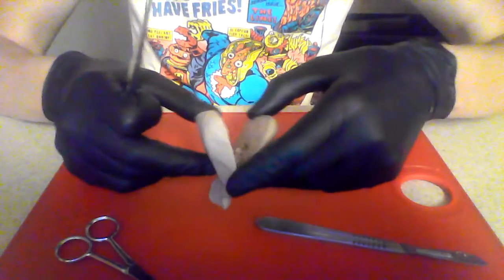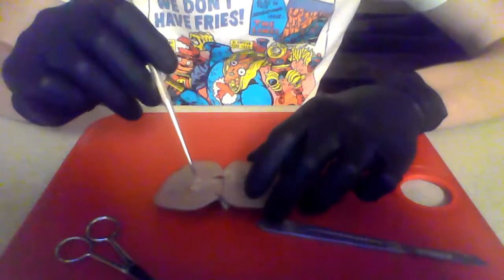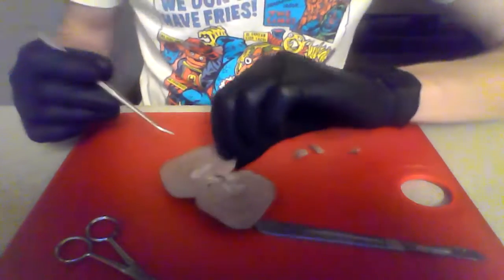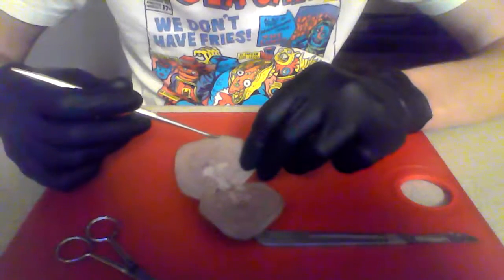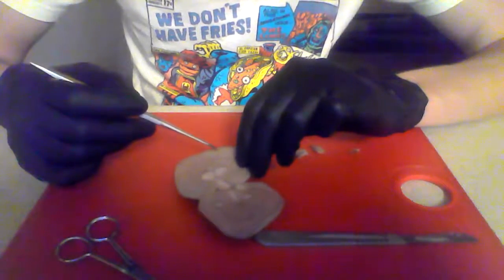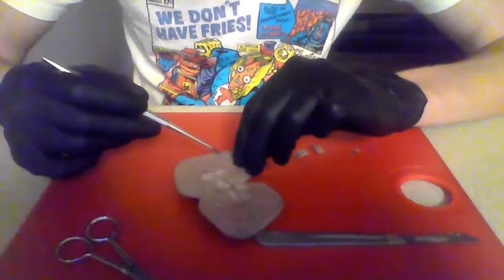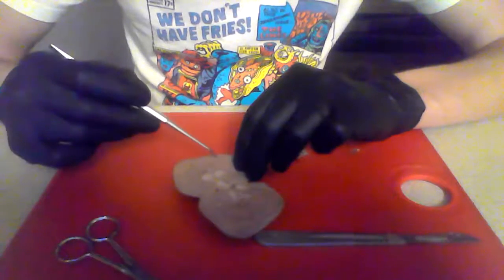So then we did a frontal section, a frontal cut of the kidney. We opened it, and immediately we can see the renal cortex, which is this structure right up here, the very outer portion of the kidney. The renal cortex contains various structures, for example, the renal corpuscle, which is a site of blood filtration, so it filters that blood.